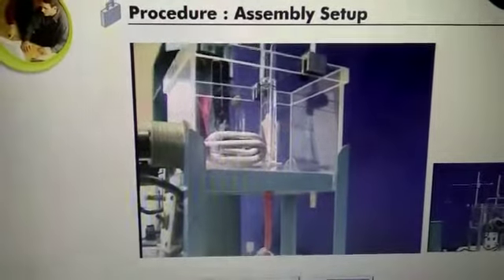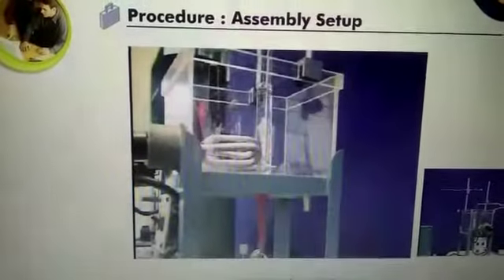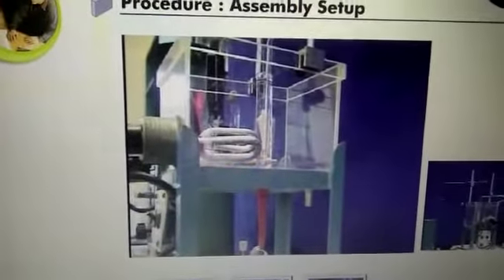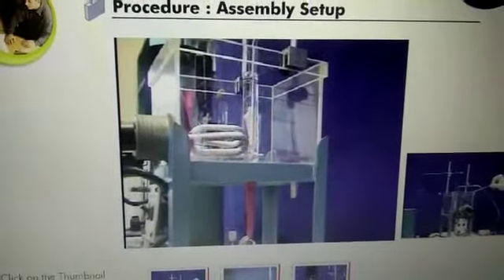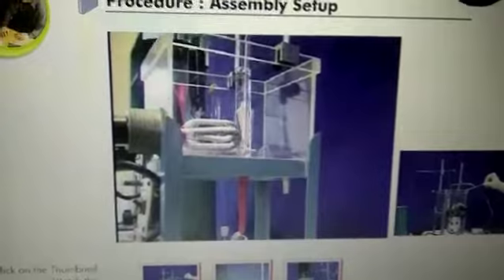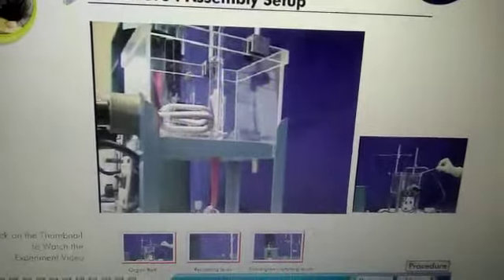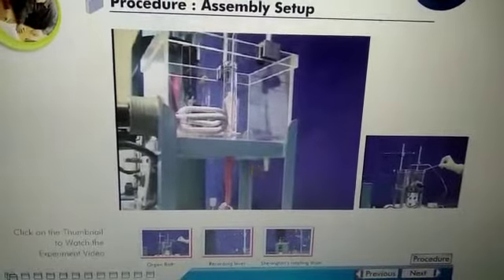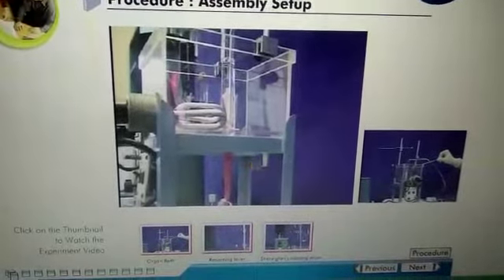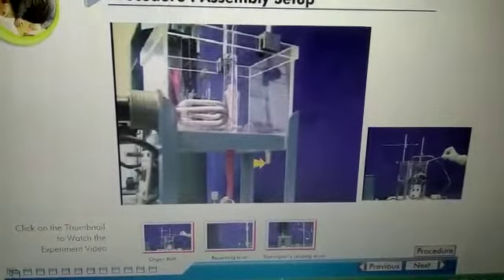Aeration tube made up of glass has dual functions. One, it will aerate mounted muscle preparation, and second, it serves as the tissue holder. The other end of tube is connected to aerator. The bottom end of tissue bath is connected to rubber tubing, which serves as outlet. The bottom side of organ bath consists of an outlet for removing water from outer jacket.